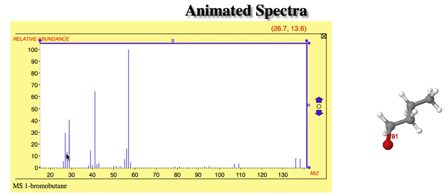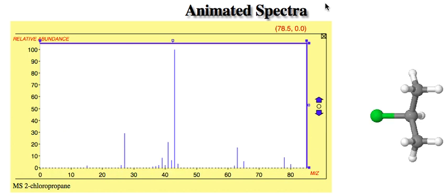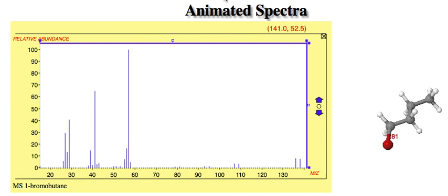And again, the same kind of losing carbons pattern back there. Okay, so this is another pretty indicative pattern. So remember bromine, we have 2 parent peaks separated by 2 units, and the ratio is about 1 to 1. And there's another peak for the bromine, let's go back to that, which is missing that 79 or 81, because that can break off pretty easily.